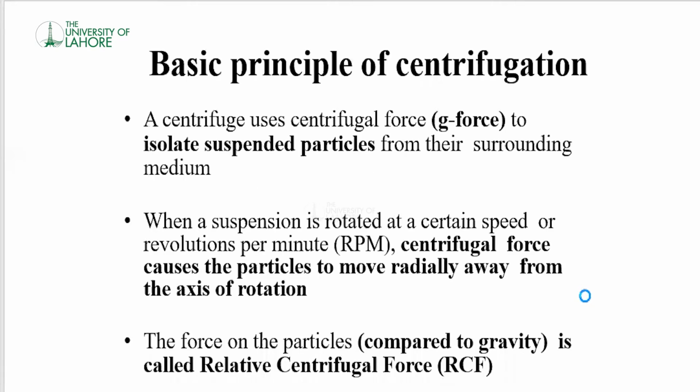Basic principle of centrifugation. A centrifuge uses centrifugal force to isolate particles from their surrounding medium. When the rotor rotates at a certain speed, the force that causes the particles to move radially outward is the centrifugal force, while the force which acts on the particle is the relative centrifugal force.